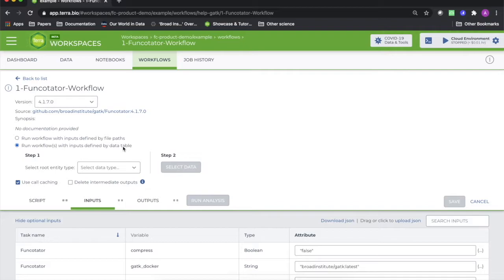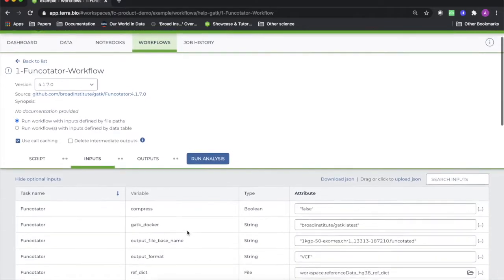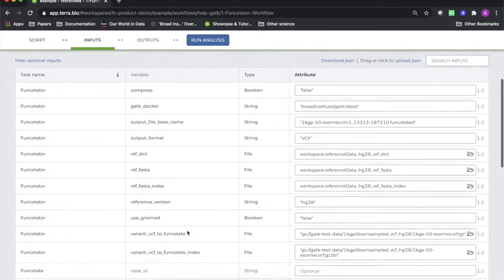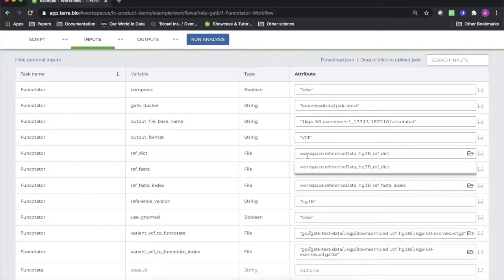By the way, if you click on this workflow, you'll notice that it comes with a preconfigured set of input and output attributes. This list of attributes is referred to as the workflow configuration, and there are multiple ways to create and save different configurations for streamlining your work.